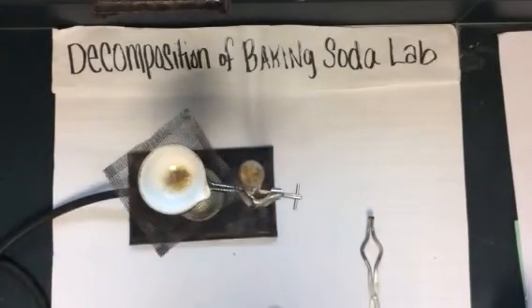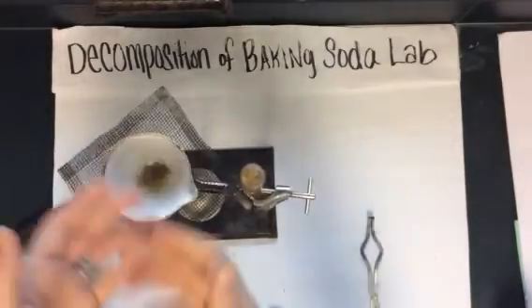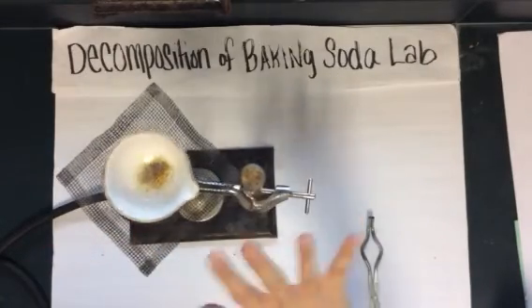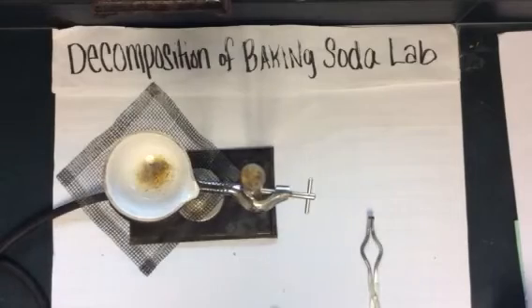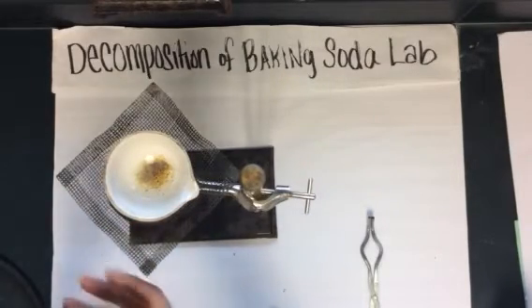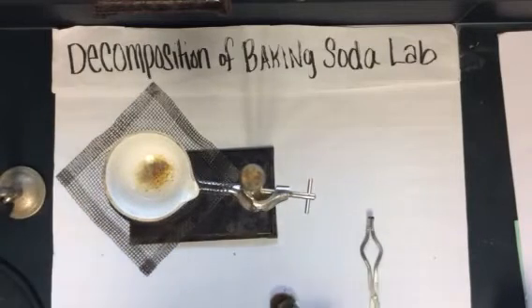You might put this under here and realize my setup here, we'll pretend, is way too high, and so it's going to take forever. So how do I adjust that? Well, remember, the minute your heat is on, your metal will get hot. So what you need to do is turn your Bunsen burner off and remove it. Remember, at any point you can move your Bunsen burner around like this. And you need to adjust this.